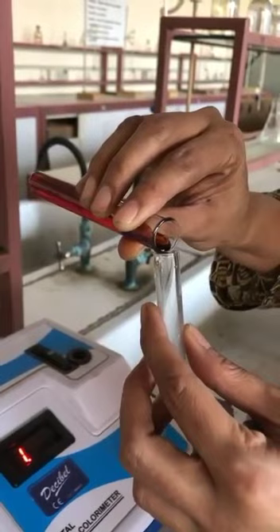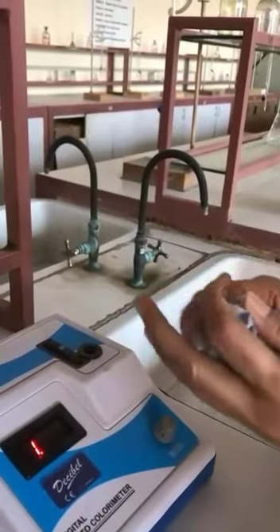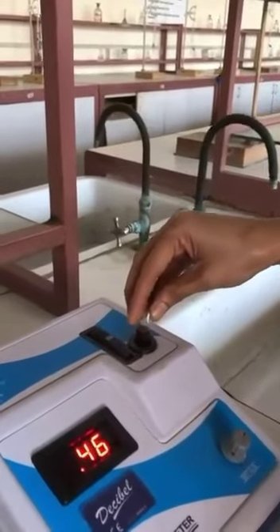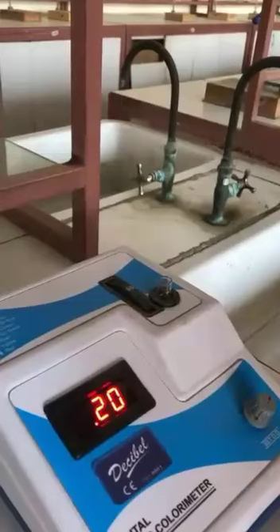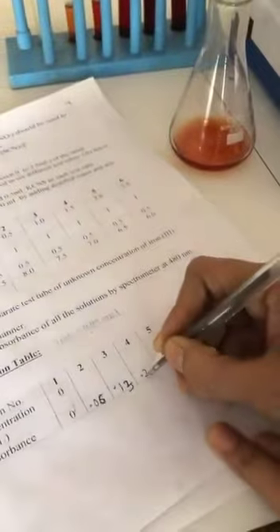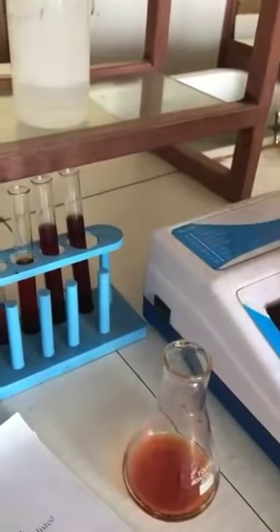Fill the cuvette again 3/4. Dry with filter paper and insert in the colorimeter. Now, the reading reported is 0.20. Now, take out the cuvette and drain the solution into the conical flask.